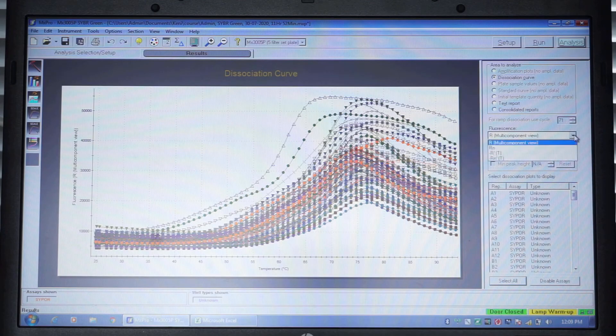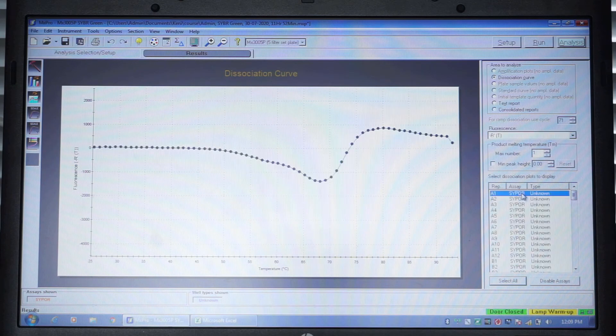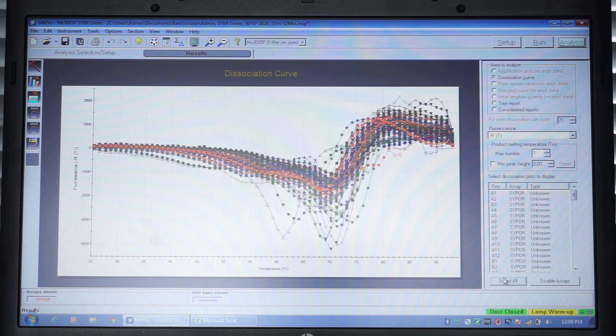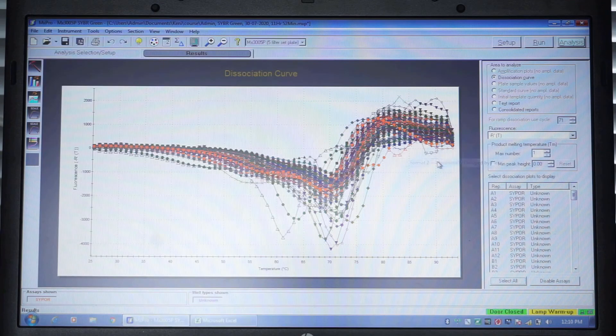Select the tab Results. Tick Dissociation Curve from the options on the upper right corner and select minus RT. From the main menu, select File, Export Chart Data, Export Chart Data to Excel, Format 2, horizontally grouped by plot. Excel will open and the file can be processed.